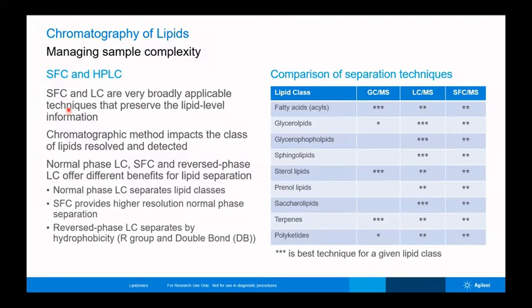In a way, I would compare it to a normal phase chromatography in terms of the separation. It can cover a good class of lipids in this case, as the LCMS does as well. So it is something to think about sometimes when you have a question and you have a certain project that you'd like to run, how to use it as a separation. SFC can be used as well for lipids, and it works very nicely.